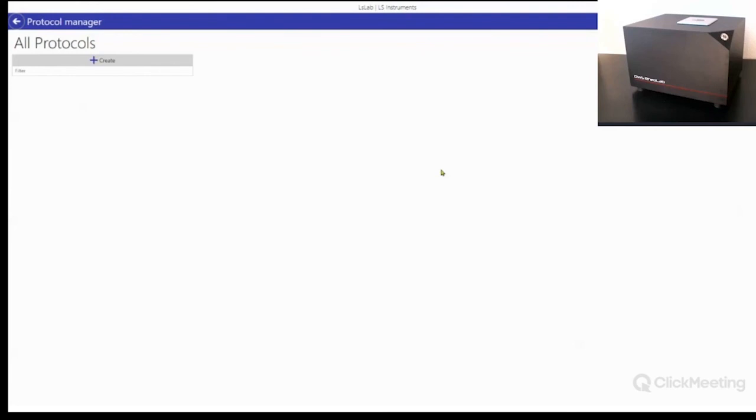Since we had usability and user-friendliness in mind, we decided to develop a fully visual language that doesn't require the user to be an expert in programming. And here I want to quickly walk you through the creation of an extremely simple protocol.